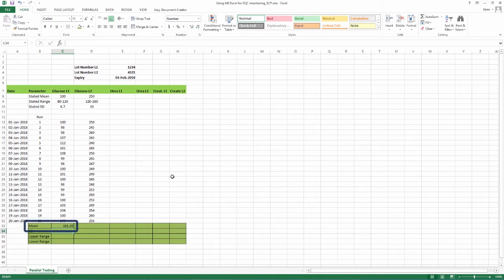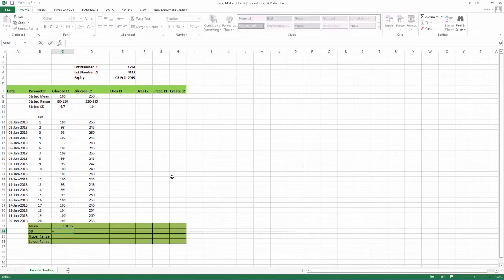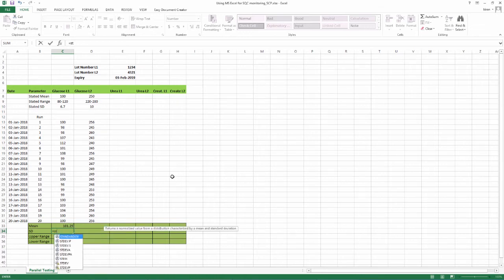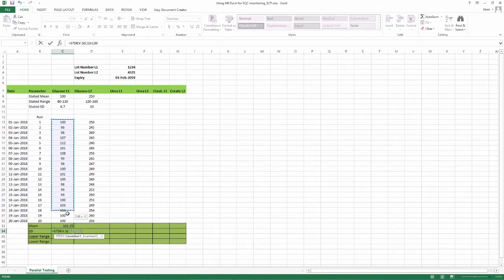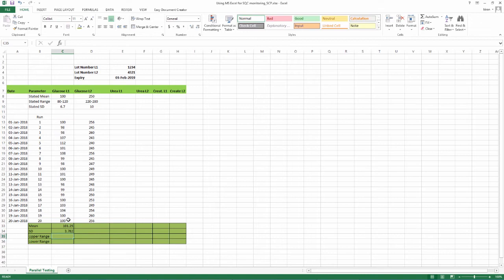Now, go to the box below that says SD under glucose level 1 and insert an equal to symbol, type STDEV.S followed by an open bracket, again select cells having values from run 1 to 20, close bracket and press enter. Standard deviation shows in that box.